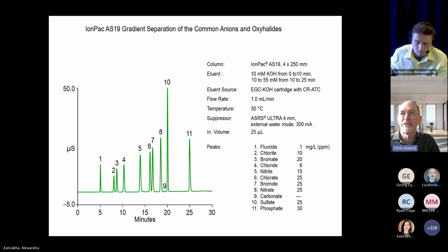maybe I could, but couldn't you just use an epoxy monomer instead? And I was thinking, yeah, I guess I could. So I started looking into it, and I found you could buy an epoxy monomer that had 2 epoxy groups. There are actually quite a few different ones like that, but there was only one that had good purity, so we bought that. And I started doing experiments with amine condensation reactions, and I found that they gelled readily.